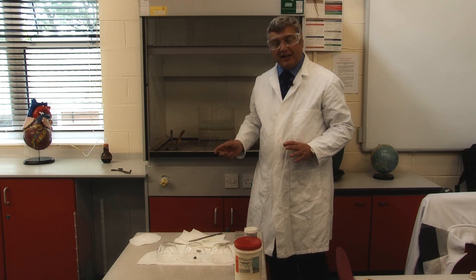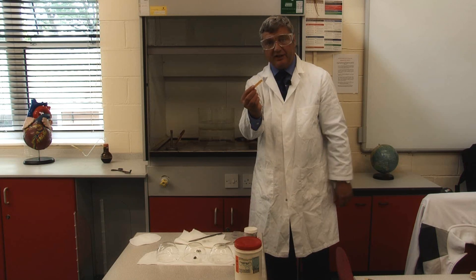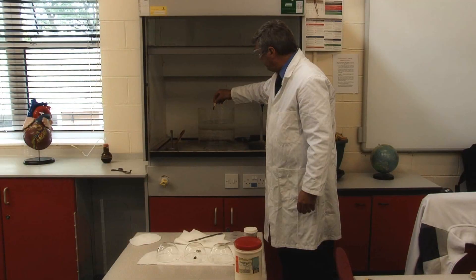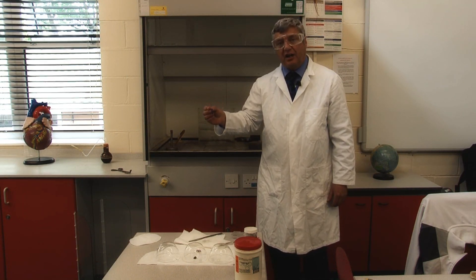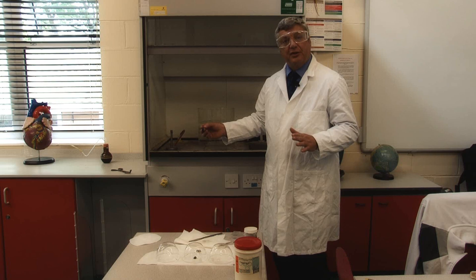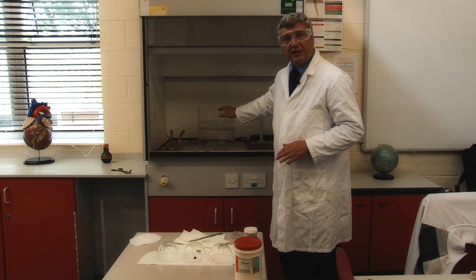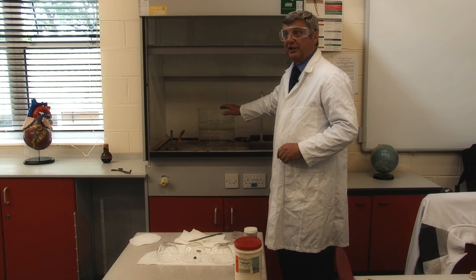Once you're sure that the reaction is finished, you can take another piece of Universal Indicator, and it's very clear that the water is highly alkaline — which is one of the reasons why these are called alkaline metals. This is also another reason to take great caution, because this is caustic and has to be disposed of carefully into the sink, which I shall do before we look at the next one.